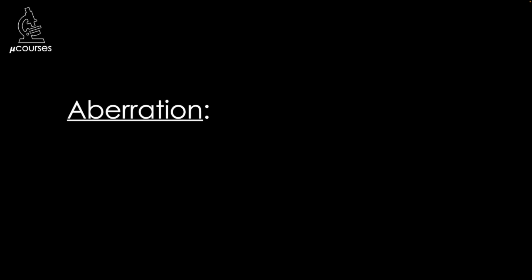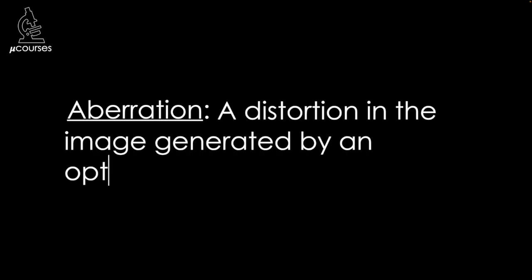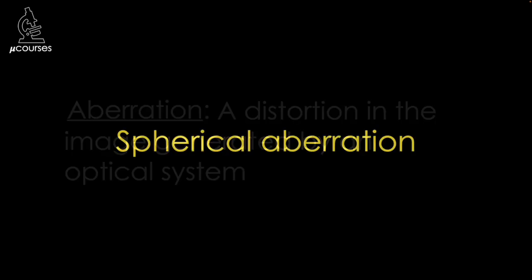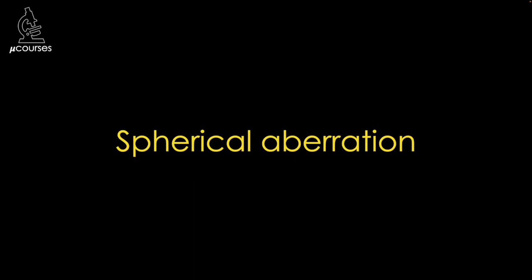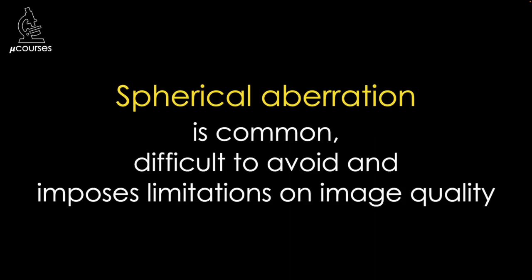An aberration is a distortion in the image, with that distortion being generated by the optical system. Spherical aberration is one of several types of aberrations that can be found in microscopy images. It is common, difficult to avoid, and imposes limitations on image quality. I'm going to go over several sources of spherical aberration, but I think it's helpful to start with the phenotype — what spherical aberration looks like and what it does to your images.